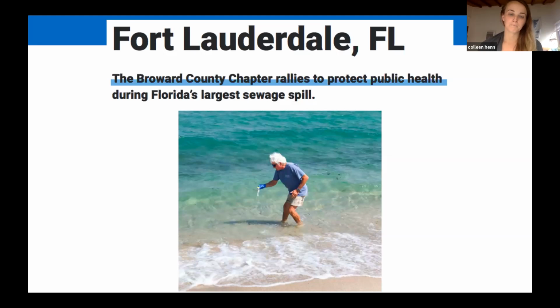So Mike runs a Blue Water Task Force program actually out of his home. He was a retired dentist and was like, well, I know how to run an autoclave and I know how to add 100 milliliters to a bottle, so I can do this. So we got him trained up on our standard operating procedures and he has a separate area in his home where he keeps an entire sterile water quality lab, which is really amazing. He was pulling a sample from 2 beaches once a month.